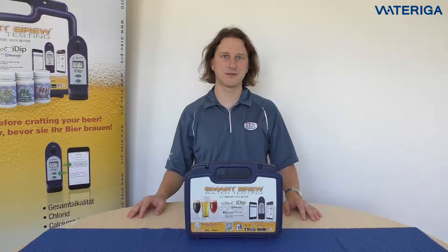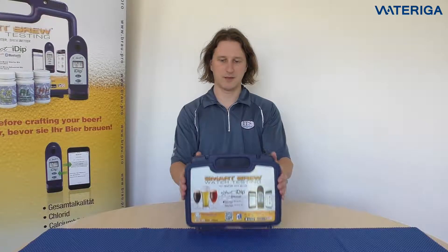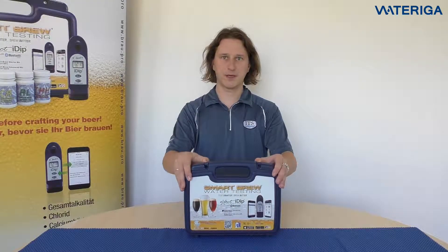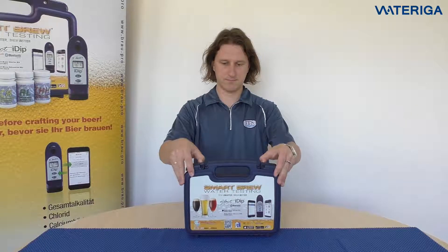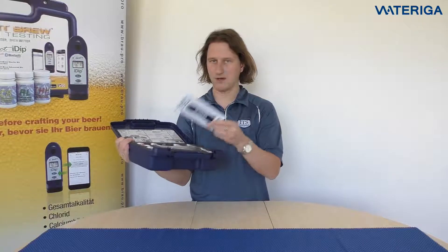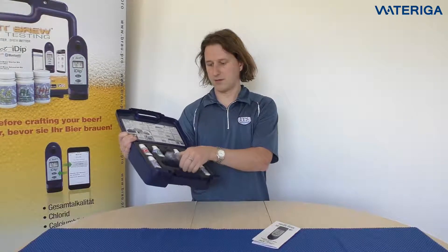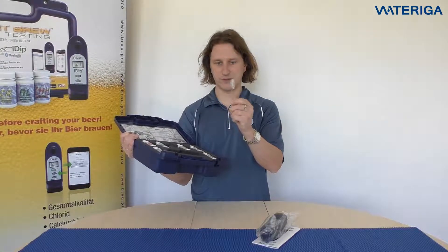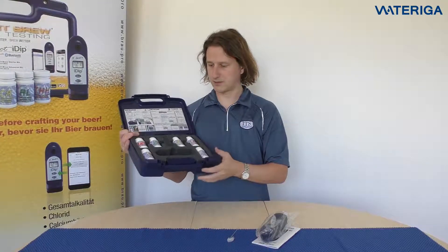Hello, my name is Maris and today we'll be looking at the Xact i-Dip Smart Brew Kit. Open the kit at the top like this, open the cover. Inside you have an instruction manual, one i-Dip, and a cleaning brush for the cell.